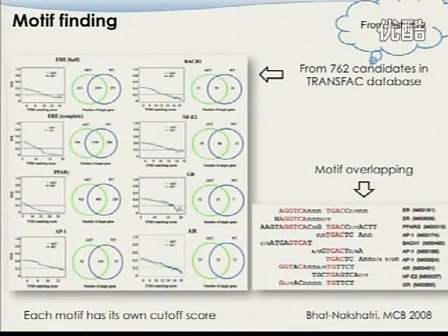This is one of the examples in a paper we published, where we used ChIP at that time, I think around 2007, and identified the estrogen receptor alpha binding sites using a ChIP experiment. We found thousands of different regions, and we searched for motif enrichment in those regions. As you can see, these are the factors that eventually show significant enrichment, the bar here is about 20% FDR, and these are the different motifs. Here are the real motifs, and you can see the sequence similarities in these regions.